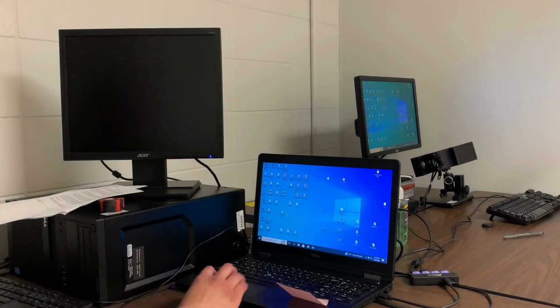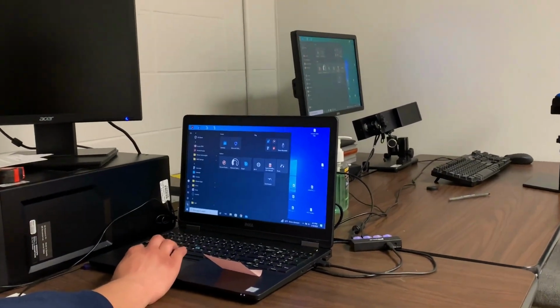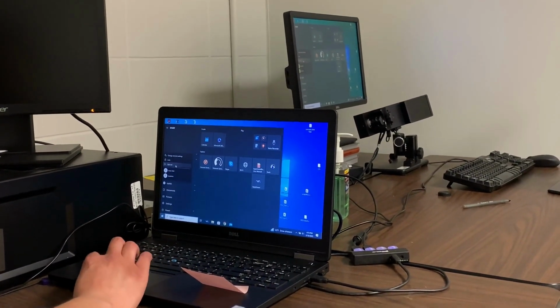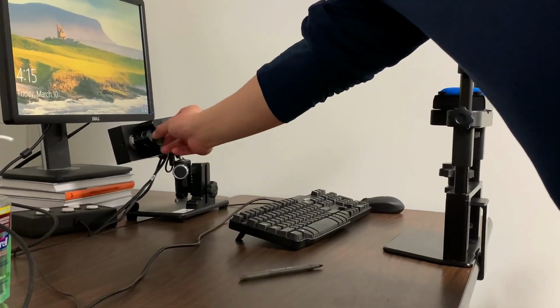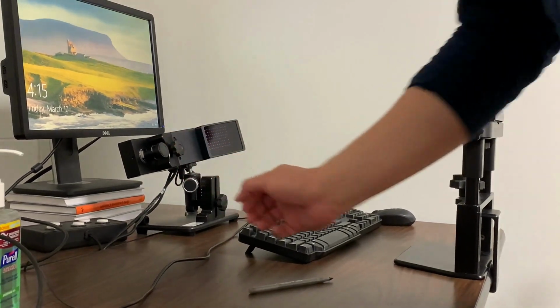And then we want to do the same with the laptop, which is going to the Windows button, up to the iLab, and clicking sign out. Don't forget to put the cap on the camera. Be nice and gentle because we don't want to scratch the lens. And always make sure to clean up after yourself.